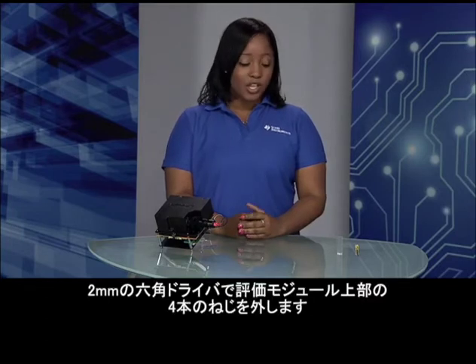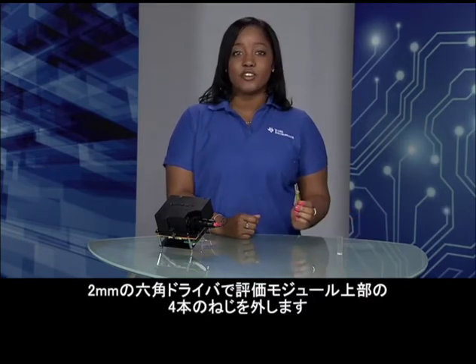Today we are taking a deeper look into the DLP NIRscan EVM optics architecture and considering some design alternatives for your spectroscopy applications. Remember, if you decide to make changes to the NIRscan, you will void your warranty for the EVM. Let's start by looking at the light engine. Using a 2mm hex screwdriver, take off the 4 screws on the top of the EVM.